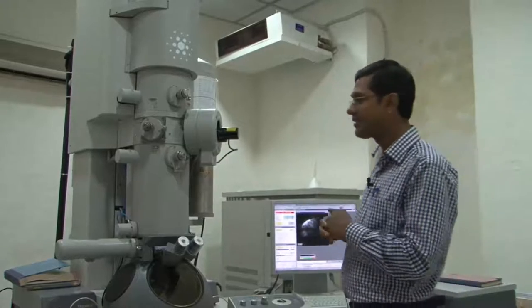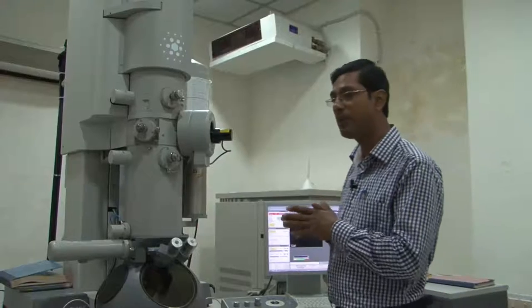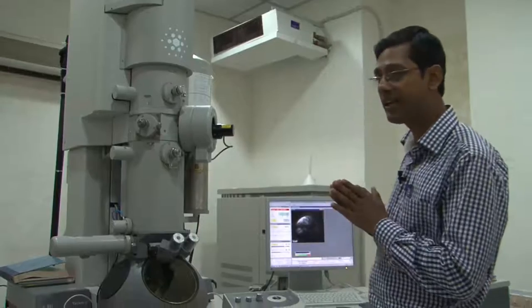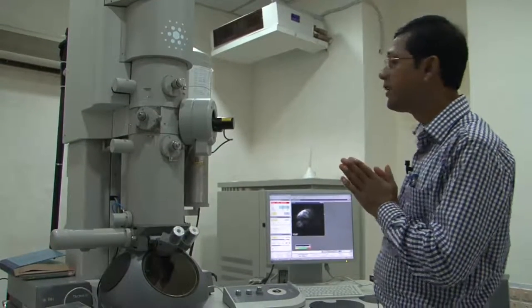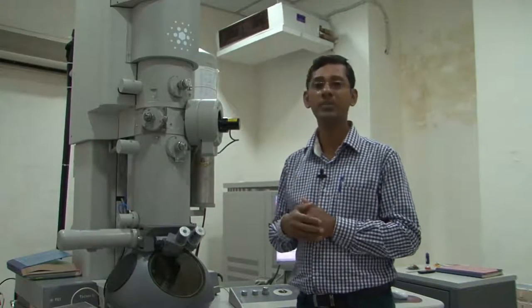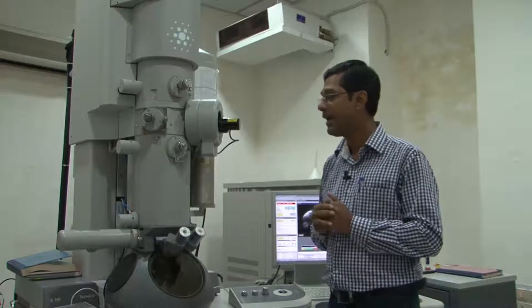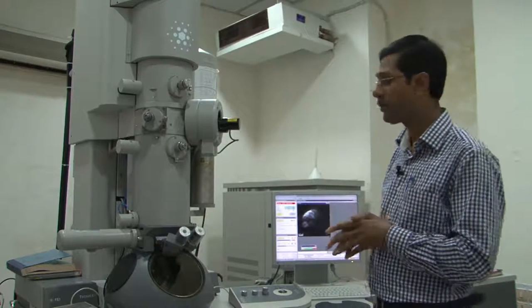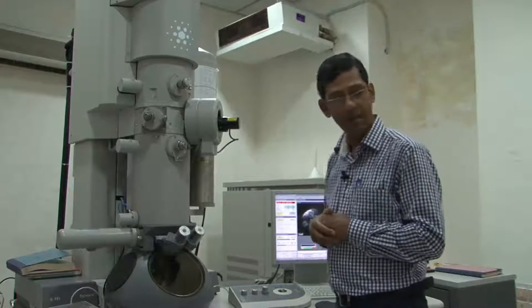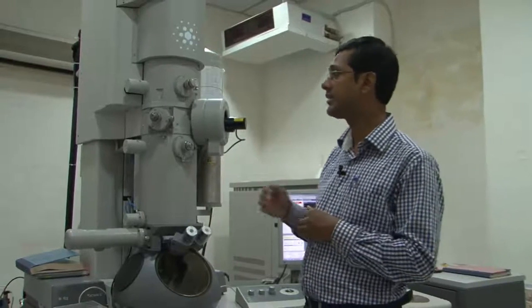In those cases, not only must the microscopes be kept in a very clean and neat environment, but the environment also has to be free from all kinds of noise. Even the noise from the air conditioner can create problems. This is the way high resolution microscopy has developed over time. From 2006 onwards, the Titan microscopes have come up in this world, and it has changed the whole concept of electron microscopy. In the class I also saw the images of the microscopy. Okay, now let us switch on the beam on the microscope and see that light up.